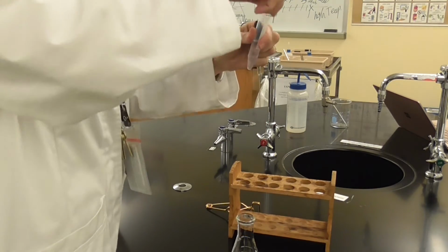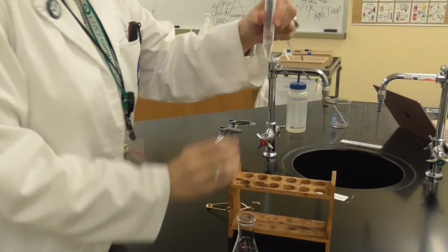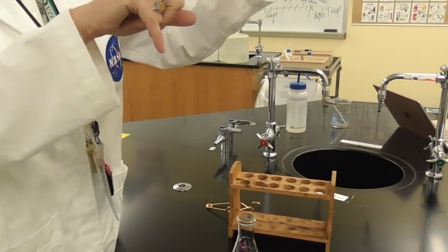That's all right, I was able to get it. These are the two layers here. The lower layer is methylene chloride.